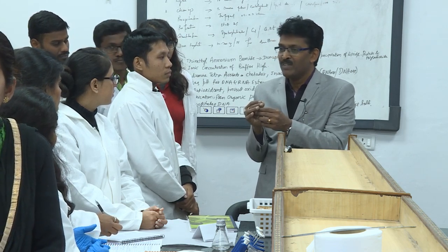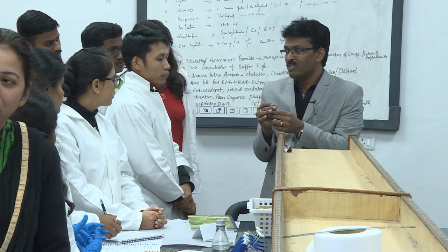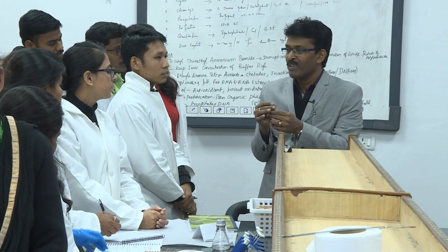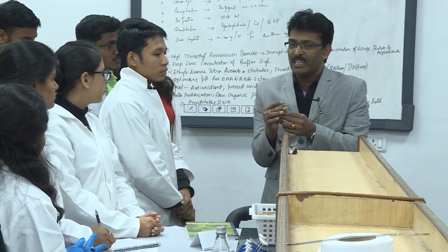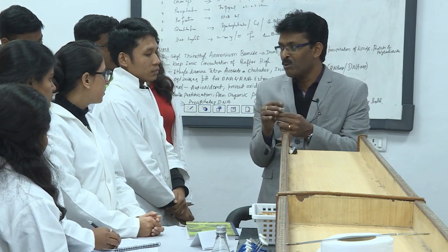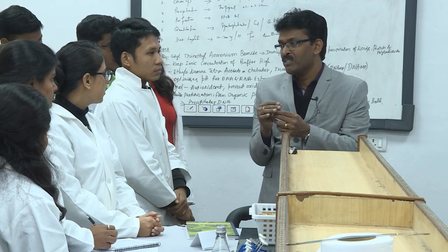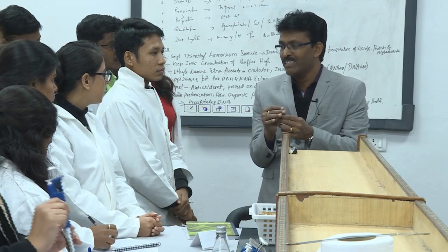So it would be better if you use some kind of coding system so that you can track the sample at any time. We have a coding system in our lab. We use the host or the source from where the sample was isolated, and if the identity is known partly, at least at genus level, you bring the genus name also there, and more importantly the place from where the sample is collected. So this is a triple code system. For example, if it is from rice, you put R. If the organism is Bacillus, you put B, right?